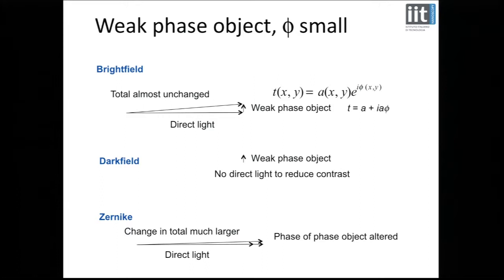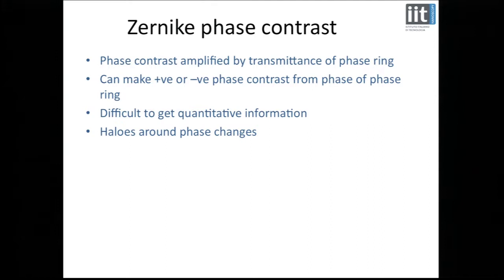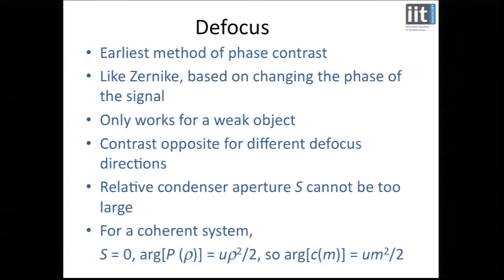This is what it does in terms of the transfer function. Again, you'll see that this is the phase contrast part, and these are bits we don't want there, like artifacts on top. I'll miss out that. Right, okay. I don't know, this has got displaced. This is talking about defocus, which I've already spoken about.